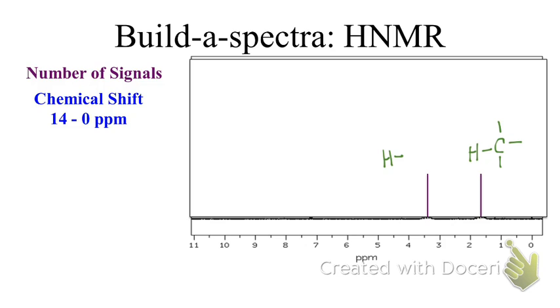What about the carbon or the structure on the left? You don't know. That's in the everything else range. That can be anything. Okay? As far as anything, because it's organic chemistry, we're looking at our halogens, nitrogen or oxygen. Okay? Could it be a halogen? Theoretically. You can be a little bit more strict than theoretically.